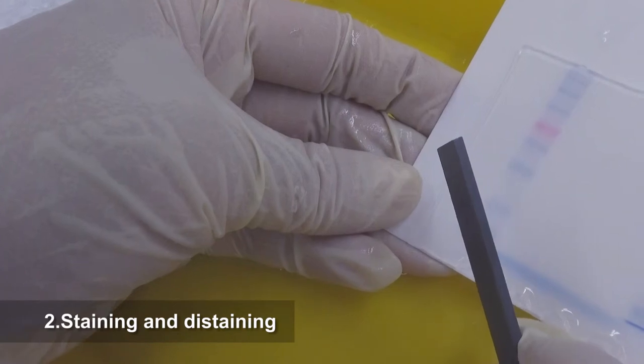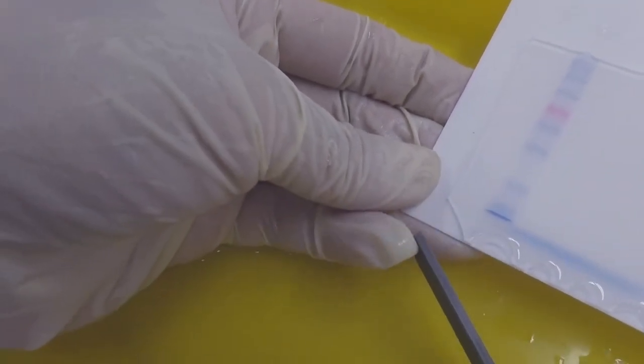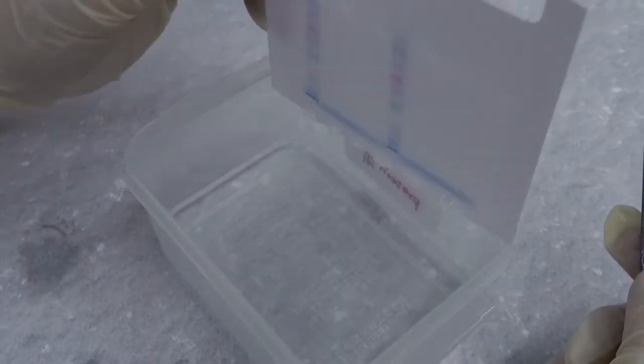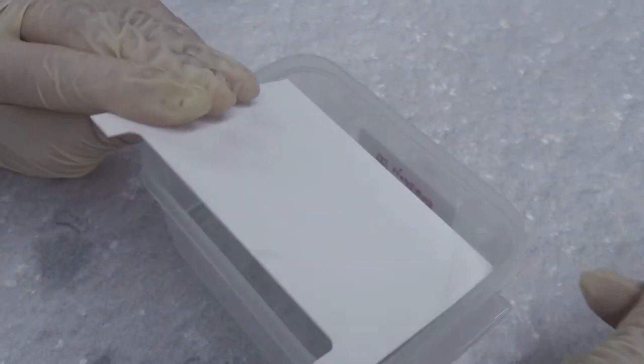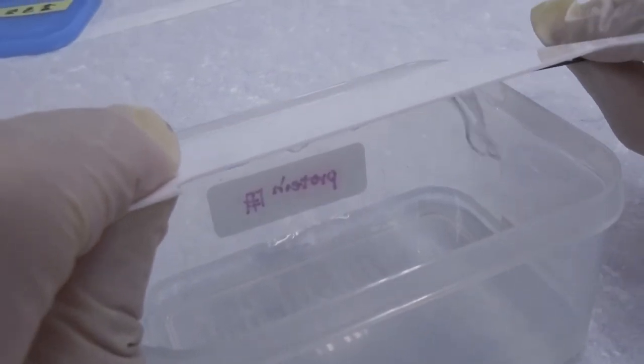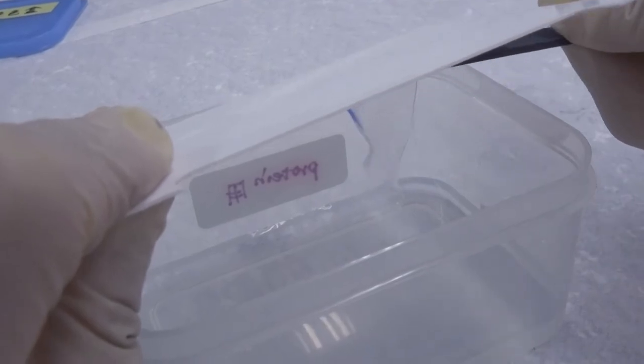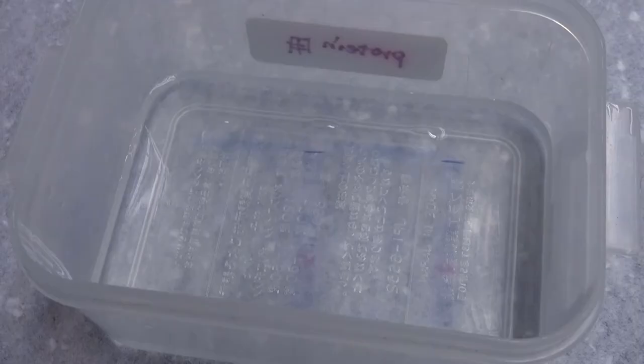Staining and destaining. Cut away the lower left corner of the gel as a reference of orientation. Inverse the aluminum plate so that the attached gel faces downward. Use a spacer to peel the gel down to the staining box containing 25 ml deionized water. You may see the gel slides down acceleratedly due to gravity.